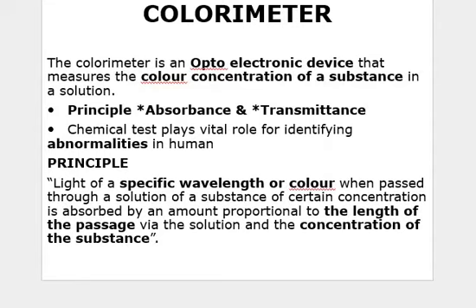The light of a specific wavelength or color is passed through a solution of a substance of certain concentration.